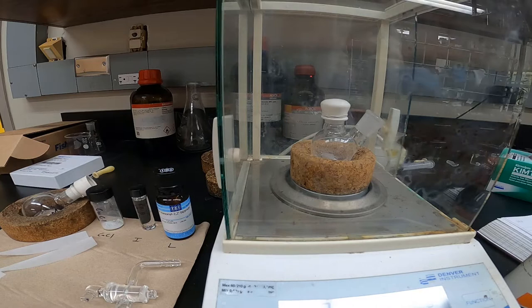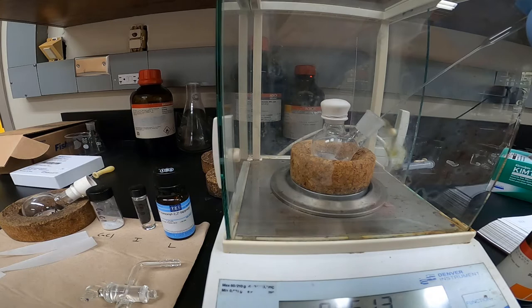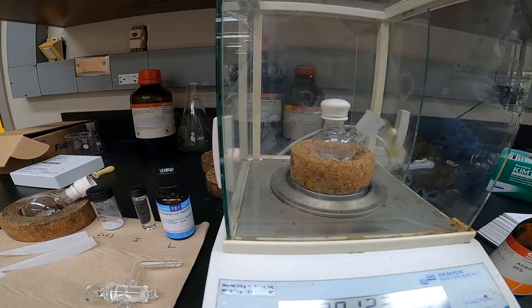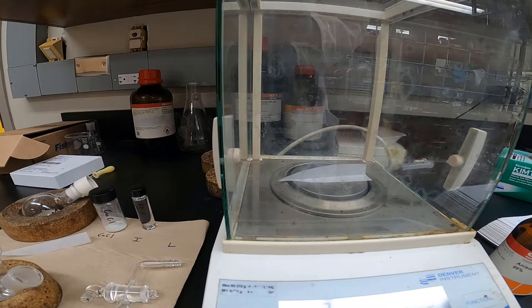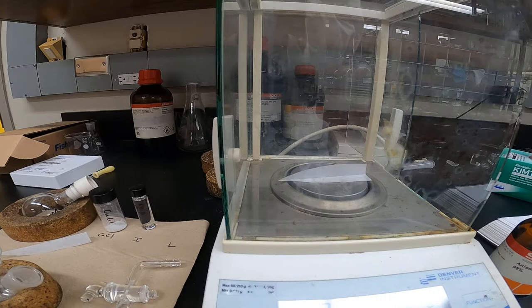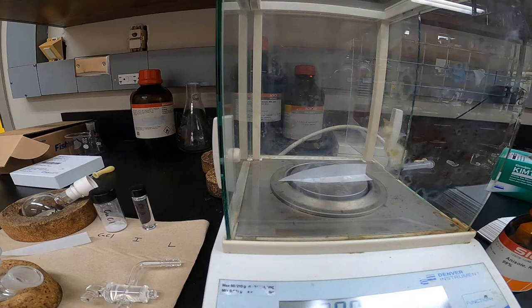Next up, I added some anisole in addition to the anisole that was added from the initiator stock solution. After the anisole, using a piece of weigh paper, I'm going to add the ligand, which in this case is a powder-like solid. Once I weigh out the appropriate amount, I'll add it to the reaction flask.